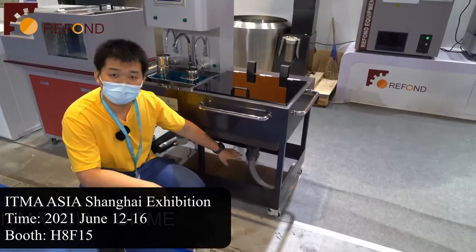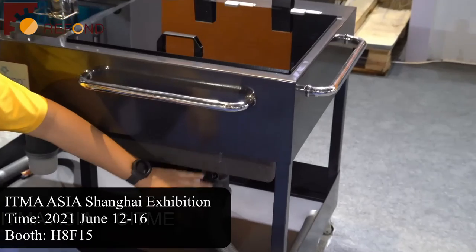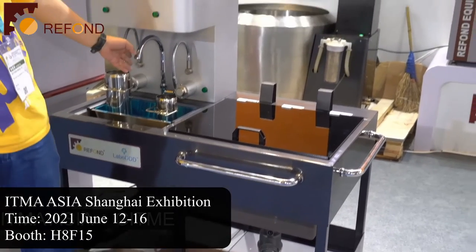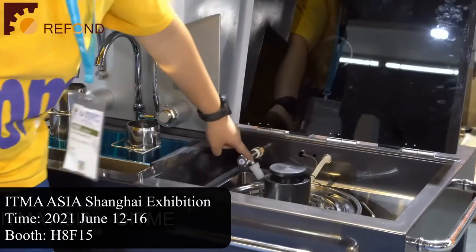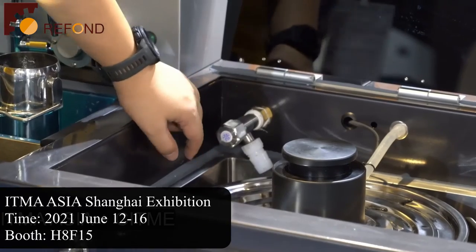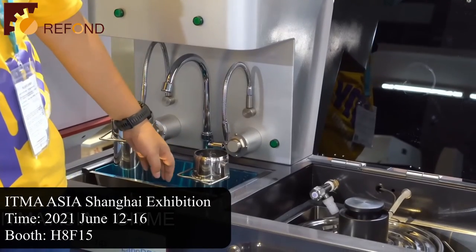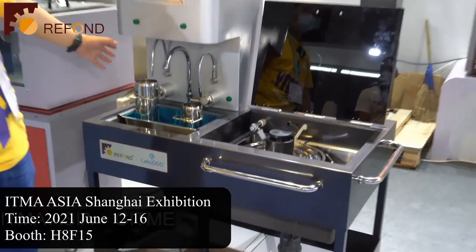We also have drain pipes at the bottom, so the water in the water bath can be easily drained out if you want to change the water or clean it. We also have two water faucets — one in the test area and one in the water bath area — to help you easily fill water into the water bath, or use tap water on the left side to clean the test cup and any detergent spills.